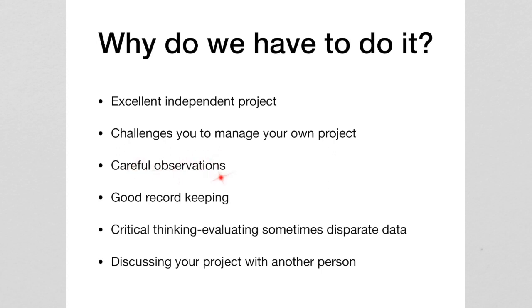You're going to need to make careful observations, because I'm not going to be over your shoulder, and even if I'm around, if I have 20 students each analyzing 2 unknowns apiece, I can't keep track of 40 experiments that I'm not seeing. So when you ask me questions, I'm going to come back to you and want to know what you observed. And along with those observations is going to be your good record keeping, the idea that you're going to need to jot down what you're doing and what you're observing.